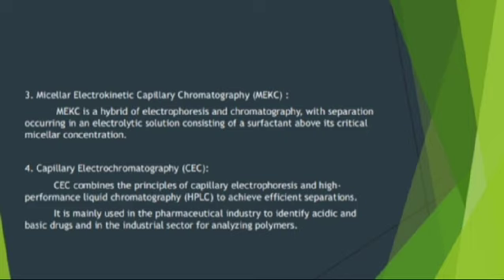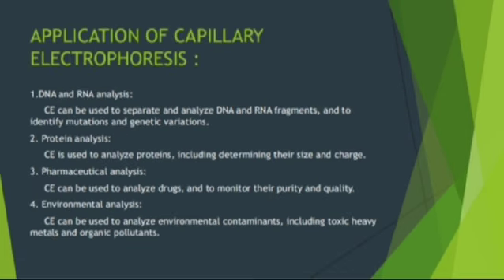It combines the principle of capillary electrophoresis and high-performance liquid chromatography to achieve efficient separation. It is mainly used in the pharmaceutical industry to identify acidic and basic drugs and in the industrial sector for analyzing polymers. Application of capillary electrophoresis.